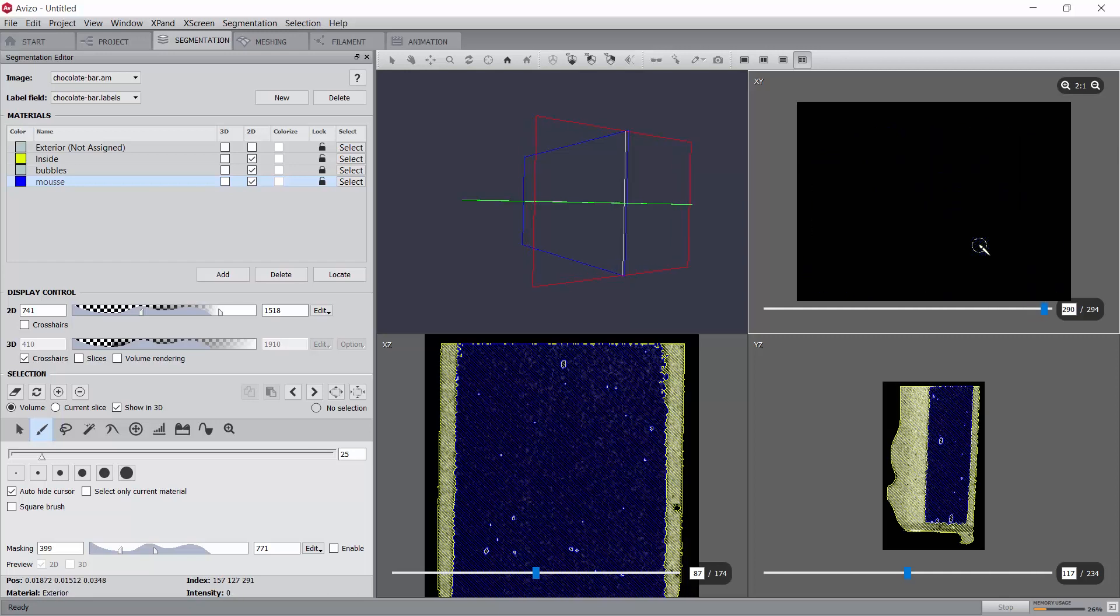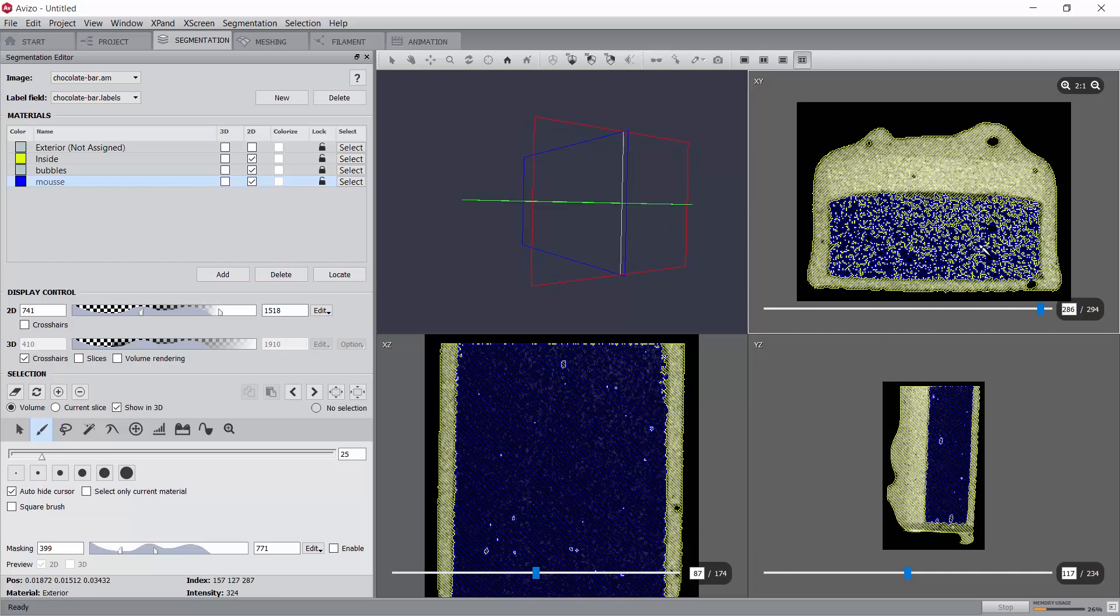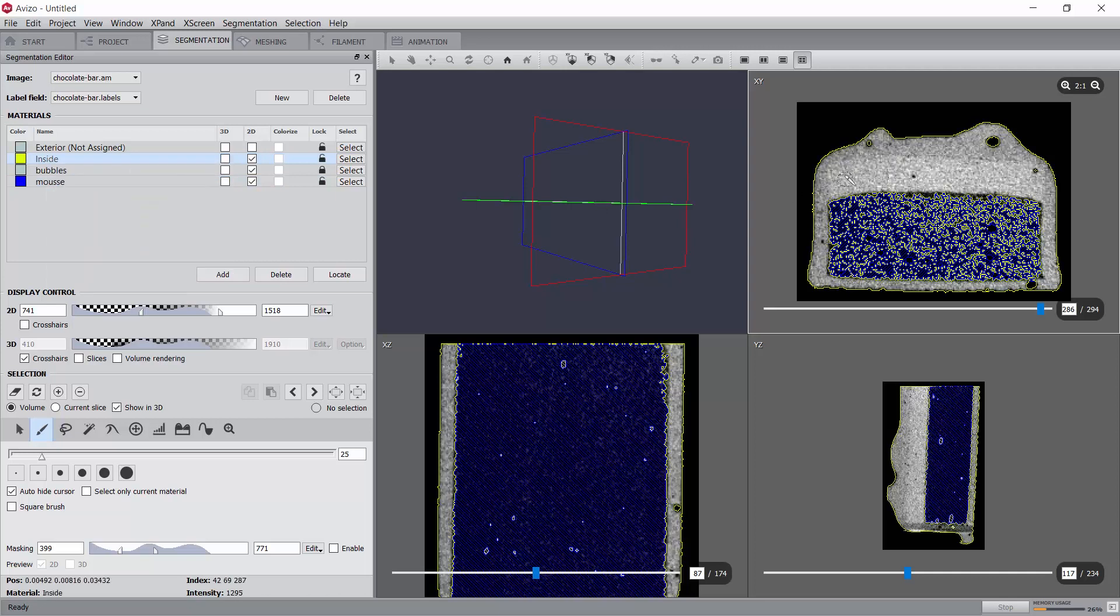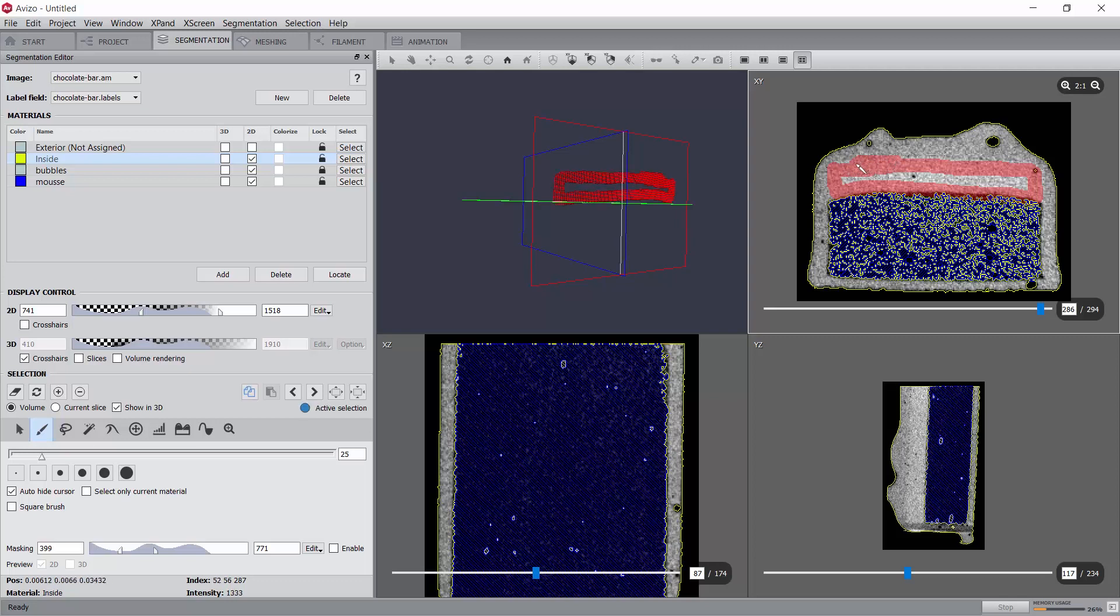Let's start with one end of the layer, for example this slice 286, and use the paint tool to select the caramel layer on that slice. Using Ctrl and left click, you can erase from the selection, and with a right click, you can fill the selected area that is enclosed by your selection.